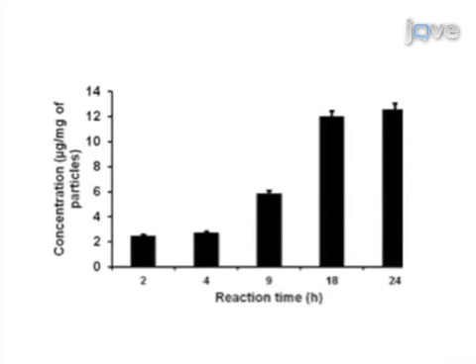Ultimately, utilizing the high-throughput methodology described here, the reaction conditions to optimize nanoparticle morphology and carbohydrate density on the particle surface have been obtained.